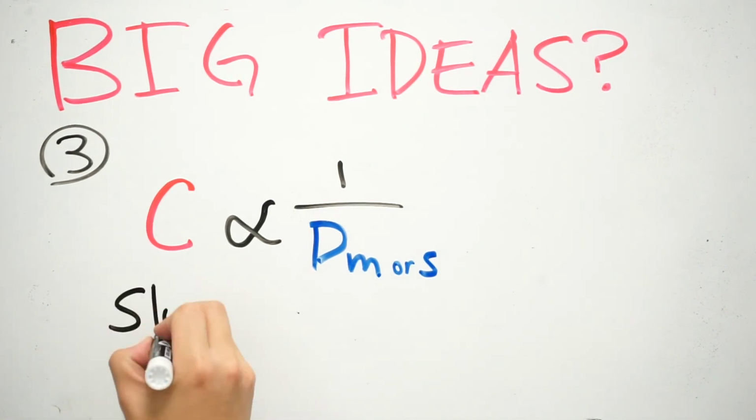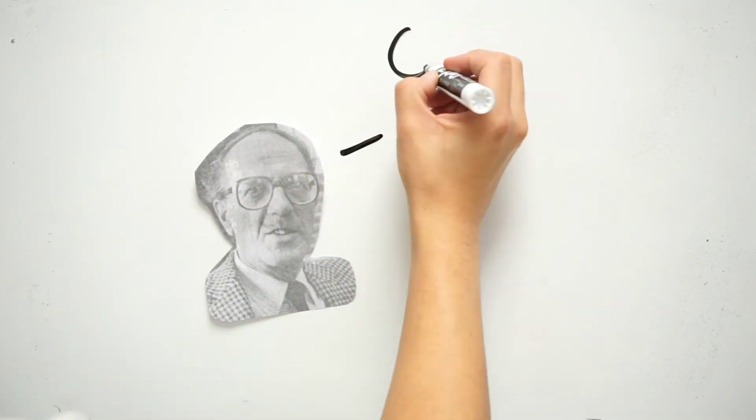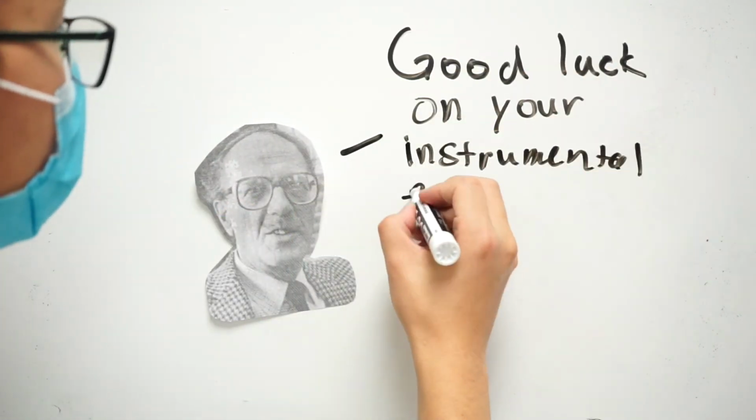The worse its ability to diffuse, the worse your resolution is going to be, so take the time to consider what aspects of your column may be exacerbating these effects. By understanding the C term, we end up being just one step closer to optimization and the ultimate goal of nice sharp peaks.